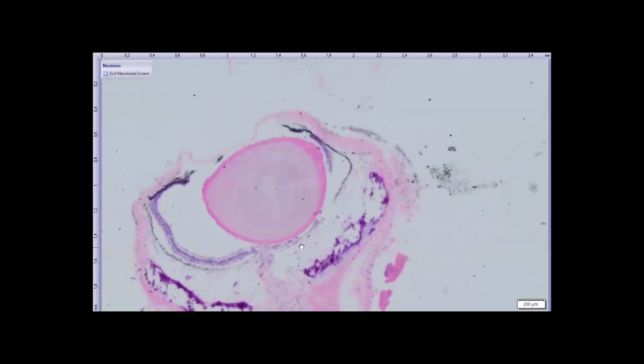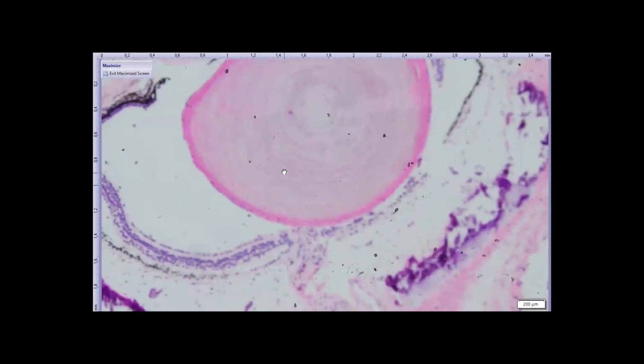This is a section of a teeny tiny eye from a lobe fin fish. You can see already that the cartilage has become mineralized, and that's probably pathology. I'm not going to go beyond that to any extent. You can't really prove it in here, but trust me, they would have a round spherical lens because they have no interest in seeing above water. Well, actually, I don't know. Later on, some of them crawled up on land and probably became something like an amphibian.